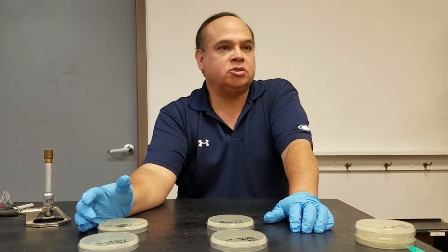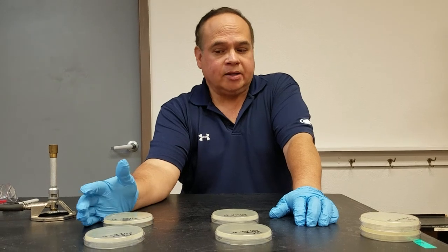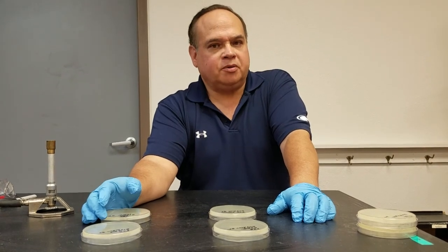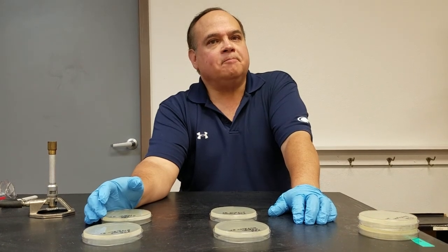Why the difference in temperatures? At 25°C, we're more likely to pick up yeast and molds. At 37°C, a permissive temperature typically found at body temperature, we're more likely to pick up bacteria.